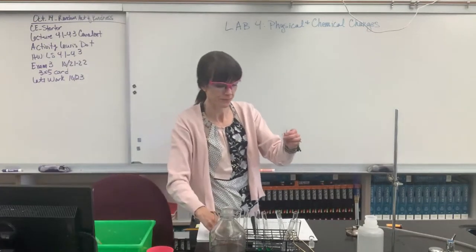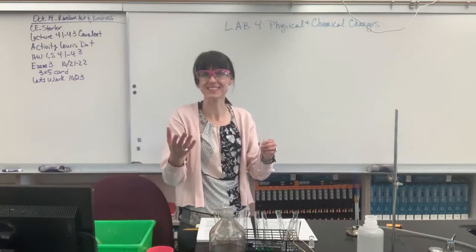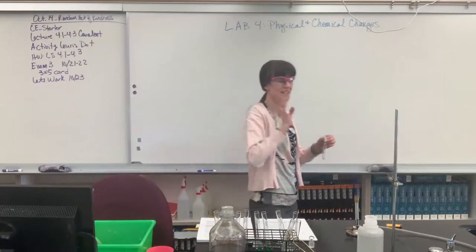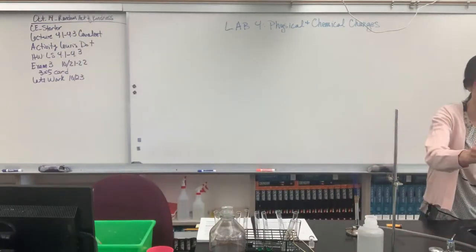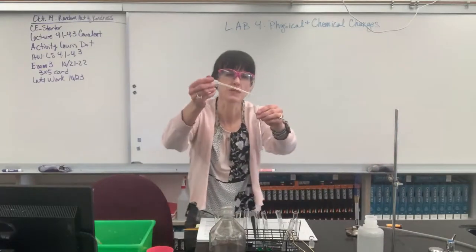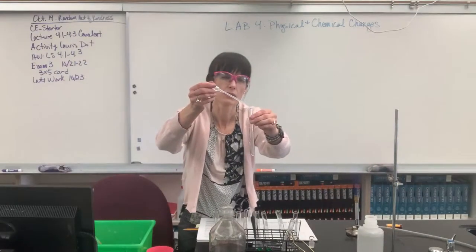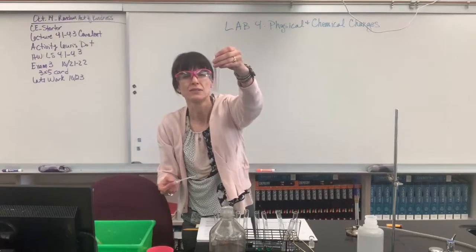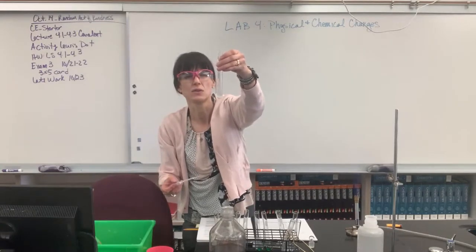Okay, there we go. Now we're going to add the HCl again. Let me make sure it's 10 drops, excuse me. 10 drops of the 6 molar HCl. All right, here we go. So 10 drops. 1, 2. Oh, wow. So also definitely evolving gas.